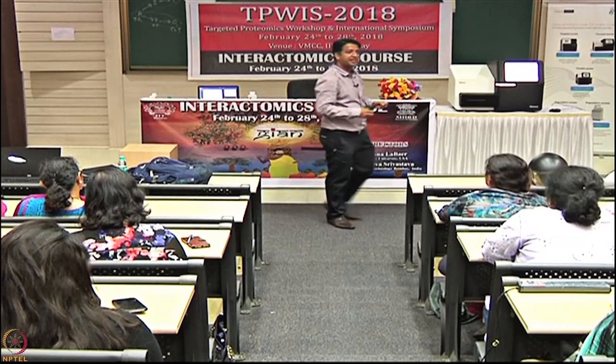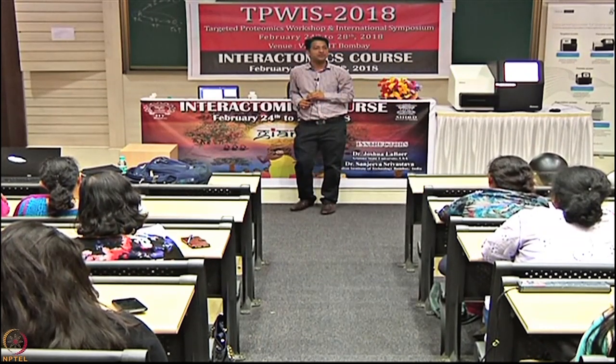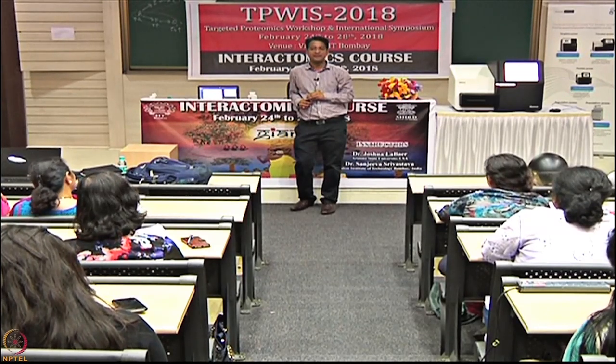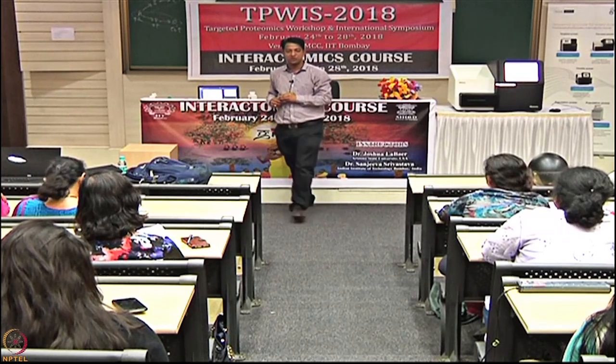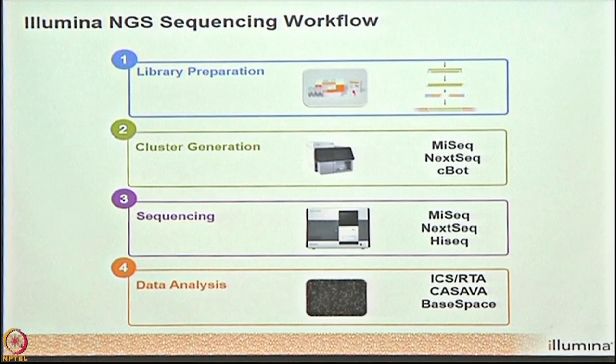No. So with the help of NGS technologies, you can sequence 50 human genomes in a span of 48 hours. How many? 50 human genomes in a span of 48 hours. So the key idea remains the same. The principle remains the same.